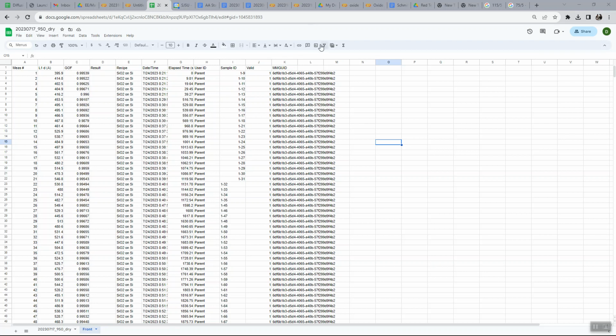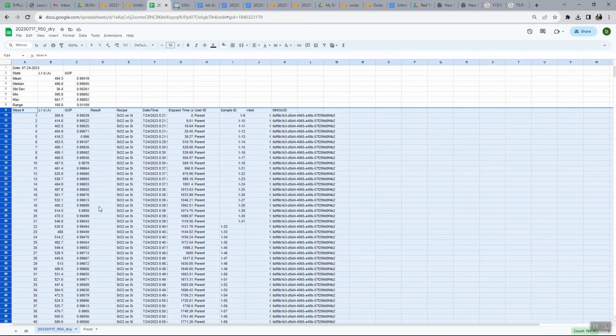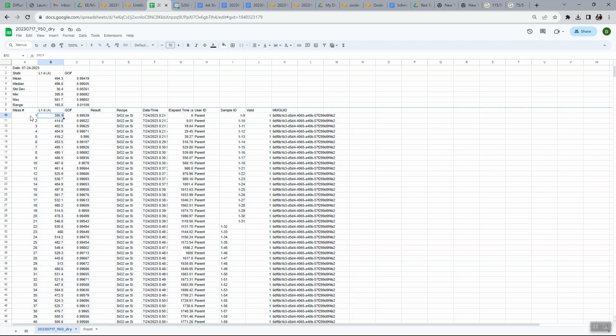Alrighty, let's plot some Filmetrics data from an oxide run. When you collect the data using the Filmetrics software, it just takes one measurement after another. In this context, the first measurement is position 1, then the second is 2, 3, 4, 5, as outlined in the manual, and that's wafer 1.